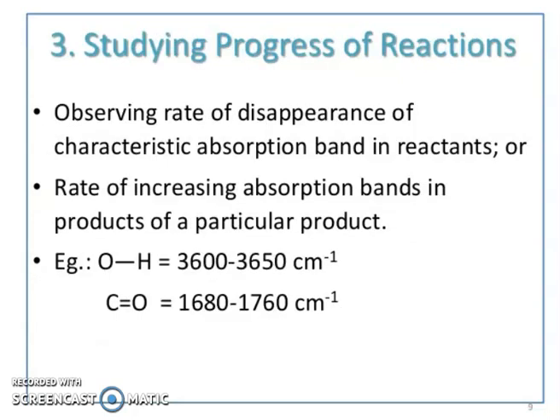Third application is studying the progress of reactions. Observing the rate of disappearance of a characteristic absorption band in reactants, or the rate of increase of an absorption band in the products of a particular reaction. So OH and carbon double bond oxygen.